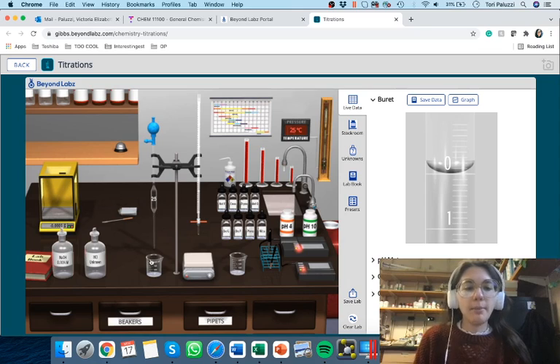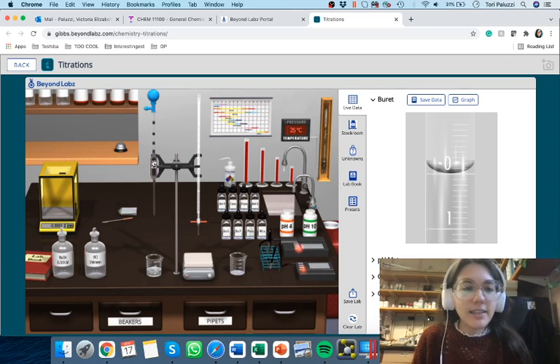Same thing with my pipette. So I'm going to take this, I'm going to pour that into my beaker. She says about 3/4 full. I'm going to be honest, I do half full because I get scared it's going to spill, a common theme that I've found when going through these labs. I then hit the little bulb. And yeah, it's done this. It's an error. It doesn't work now.